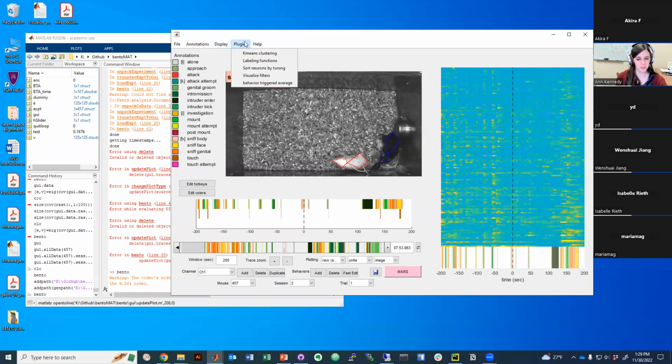And then we have a set of plugins. So the goal of Bento going forward is to make something that's, like I say, kind of ImageJ for these kinds of data sets. So once the data is loaded into the standard format that Bento uses for displaying, we can pass data packaged in that format to other downstream functions to process it.